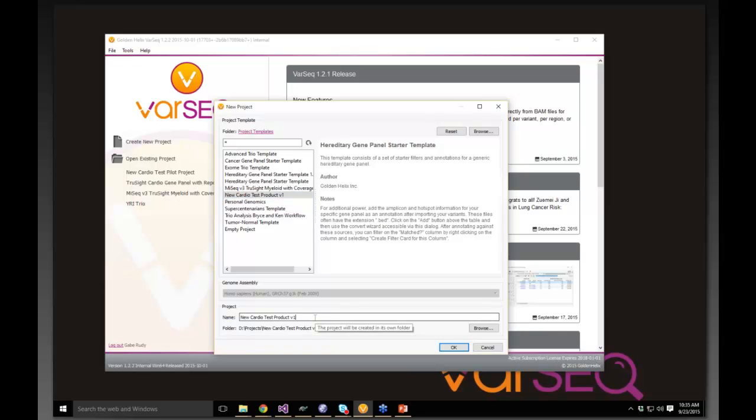And so on a week-to-week basis, you can actually use this template in an automated fashion by leveraging our VS pipeline, which can run as part of your automated bioinformatics pipeline. After those VCFs are created, you can take this template and produce a project that contains one or more samples. But we could also do this interactively. If we don't have a high throughput environment, that might be just fine.